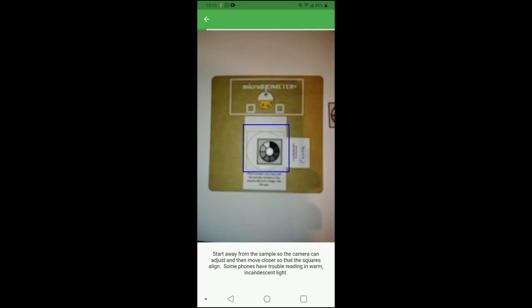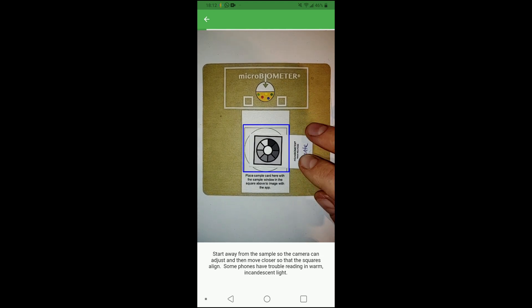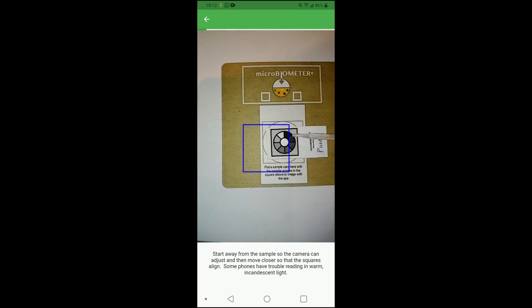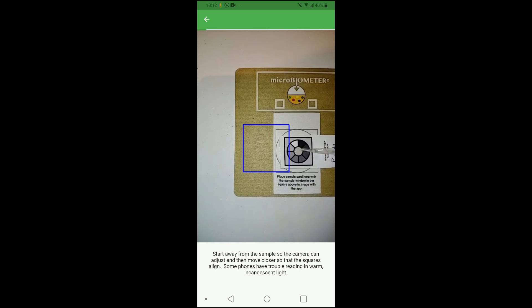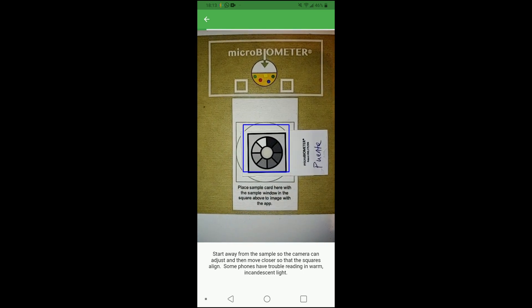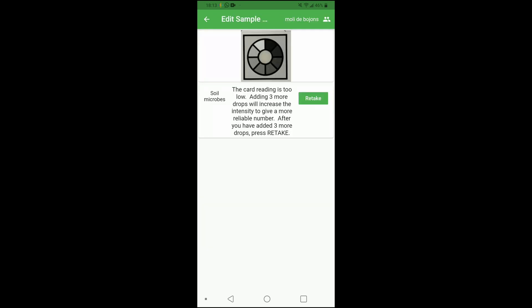It'll immediately take you to the place where you put your little soil sample on top of the Microbiometer base, which helps to calibrate the colors so that readings are the same on any different type of phone or with any different type of software. I'm putting three drops — one, two, three. You start from a little bit further back and move in closer so that it has the opportunity to focus. Once that square is right there in the middle, it turns green.